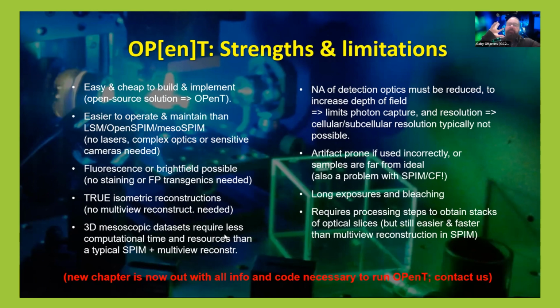Even though it requires this computation, so you don't have the instant gratification of getting the optical slices, you need to compute the optical slices. It is quite fast using GPUs, and I would argue that it's actually faster than the time it takes you to do multi-view reconstruction, which is typically what you have to do with a multi-view setup, especially for the very large samples. Now, it isn't all just nice.